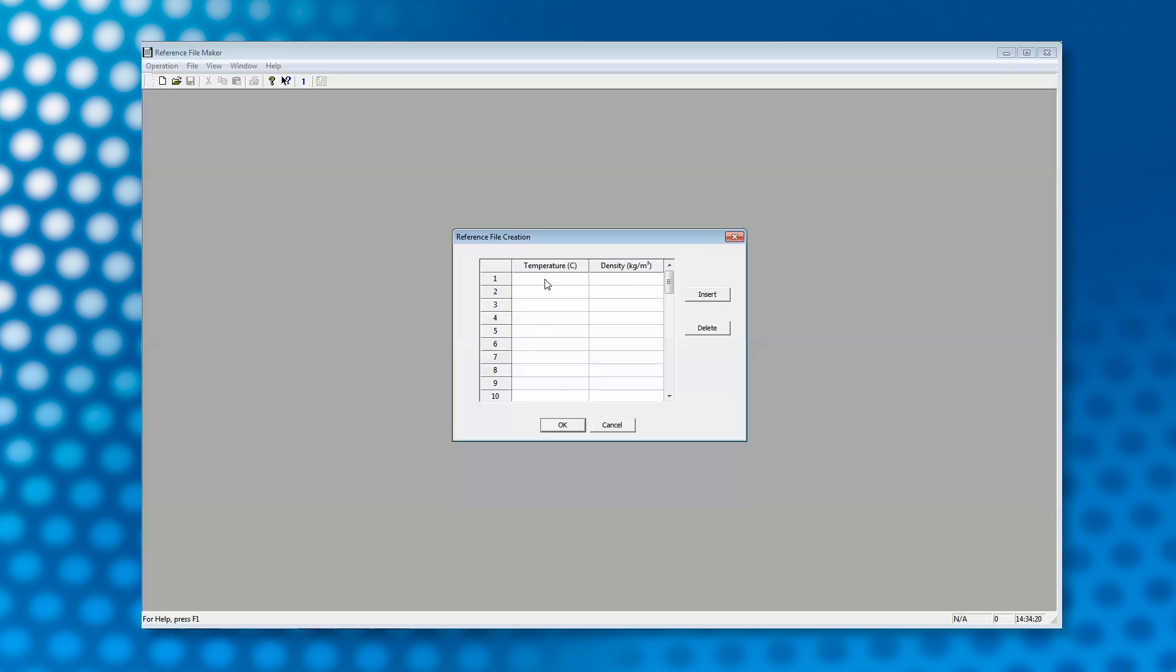Then we need to generate a density file for the unknown sample. We open the ref maker file in the instrument folder and select density as the property we want to define. It is best to have the density at the complete temperature range, but in most cases it is safe to assume the changes in the density are not significant.